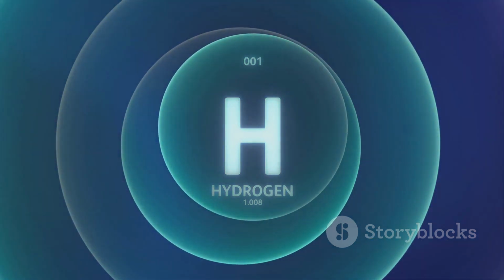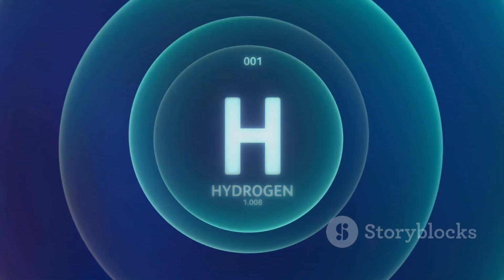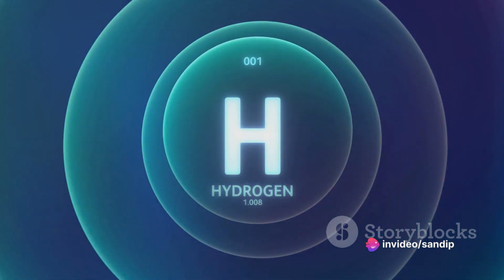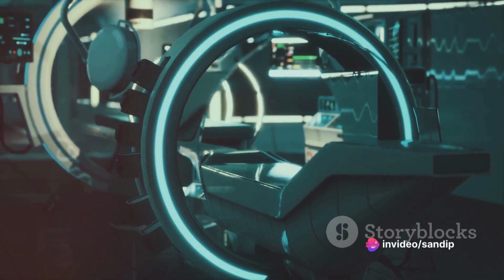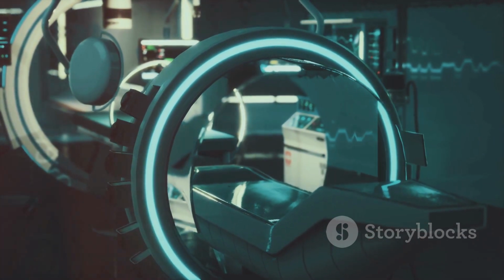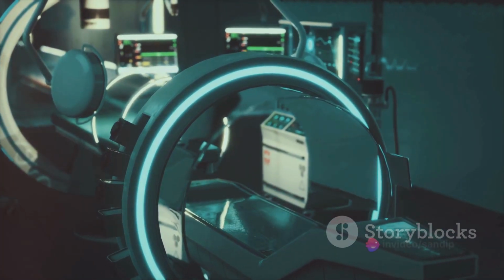Usually, more nuclei opt for the lower-energy state, but when the right amount of energy, that radio frequency radiation we mentioned earlier, is supplied, some nuclei flip from the low to the high-energy state. Once the energy is removed, the nuclei return to their original state, releasing energy in the process. This energy release is what NMR spectroscopy measures.